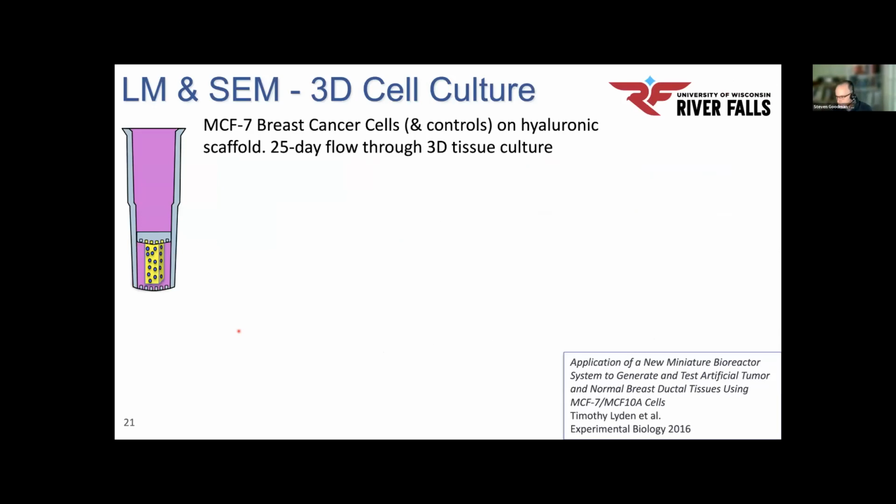I'm going to conclude with the last application area where being able to do light microscopy and SEM with a 3D cell culture system. So not strictly EM, but this laboratory did some EM, and this was published and presented at Experimental Biology many years ago now. So in this particular case, a scaffold for 3D cell culture was entrapped in the capsule, and these little dots represent the cells.